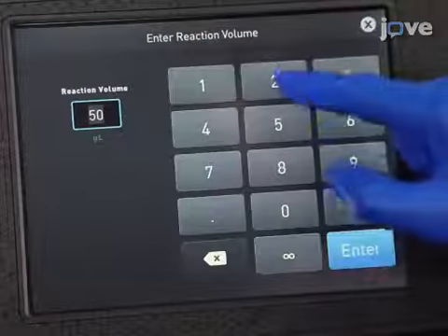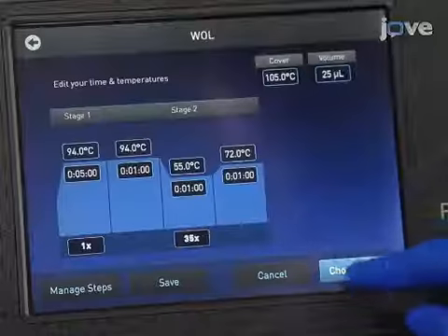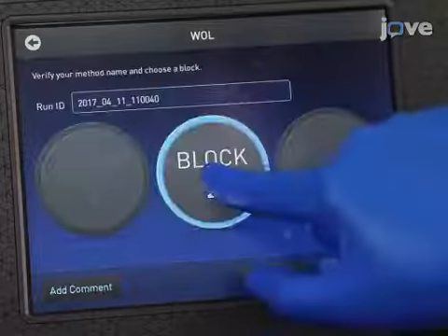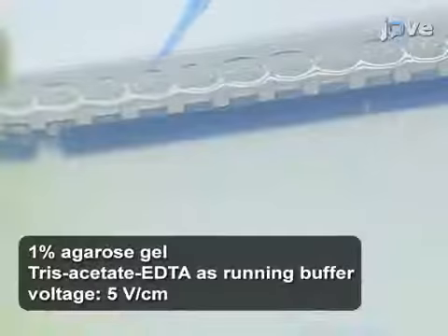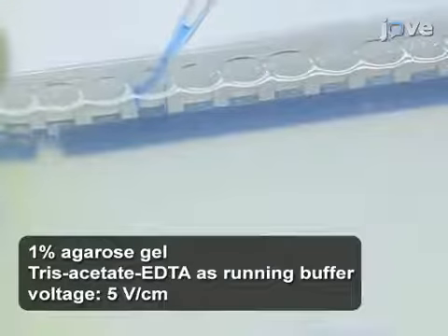To amplify specific genes of each endosymbiont within the whitefly, carry out PCR on whitefly DNA. According to a previously published protocol, subject the amplified sample to agarose gel electrophoresis and sequence.